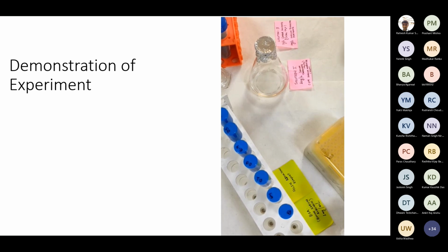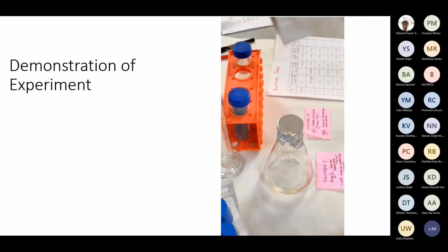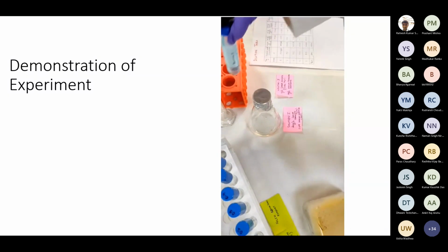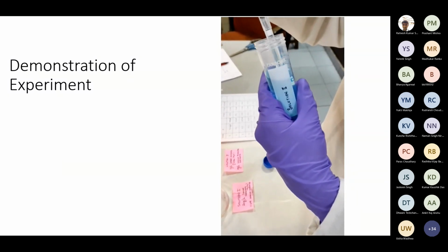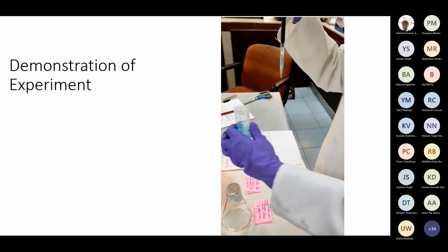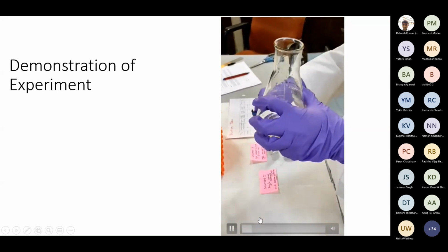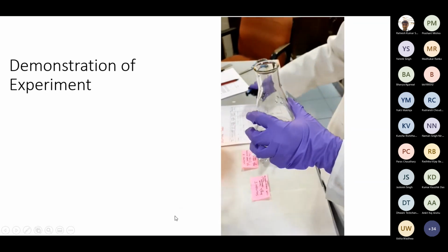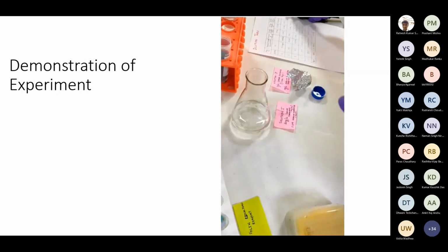And these are the clean test tubes required. So we'll start with preparing the alkaline solution. We'll mix solution 1 and solution 2. We'll take 1 ml of solution 2, which contains copper sulfate and sodium potassium tartrate, and add it into solution 1. We'll mix this solution.